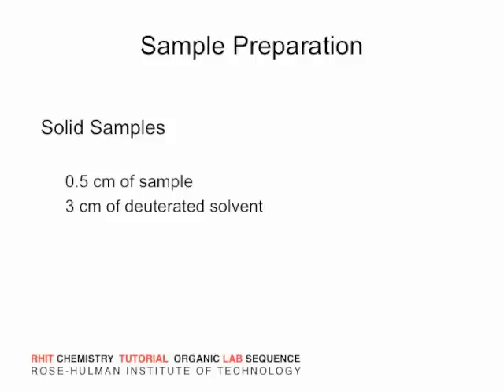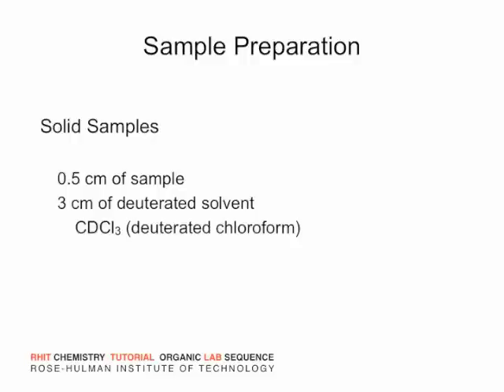Next, add about a milliliter of deuterated solvent to the sample. We have several deuterated solvents available, but we use deuterated chloroform most frequently.